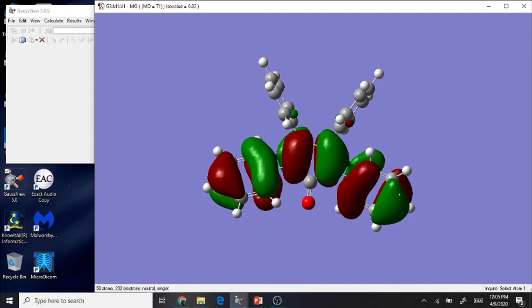In this case, we have 6 carbons on each of the phenyl rings that are conjugated, plus the 4 in the cyclopentadiene ring, for a total then of 16 carbons that are involved in the conjugation. Do the same thing with tetraphenyl naphthalene. Count up the number of carbons that are covered with these orbitals, how many are involved in conjugation, and that tells you the relative degree of conjugation in tetraphenyl cyclopentadienone versus tetraphenyl naphthalene. And this is what you will compare with the UV visible spectrum.